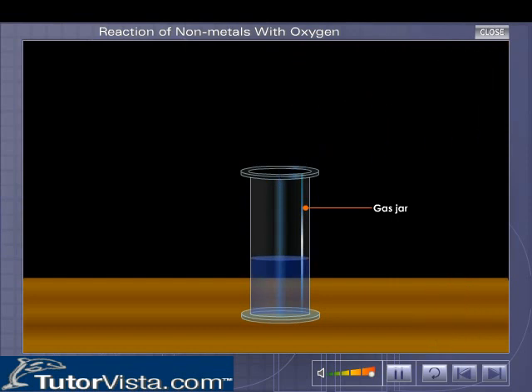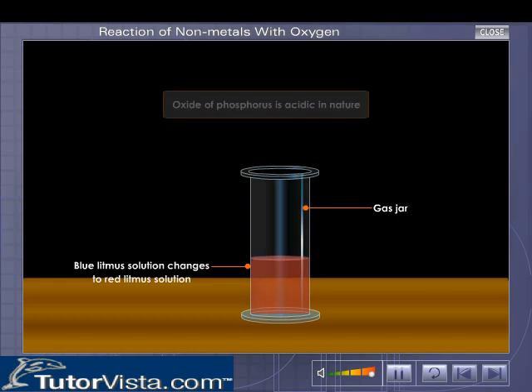The color of the litmus changes to red. It shows that the oxide of phosphorus is acidic in nature. This experiment proves that non-metallic oxides are acidic in nature.